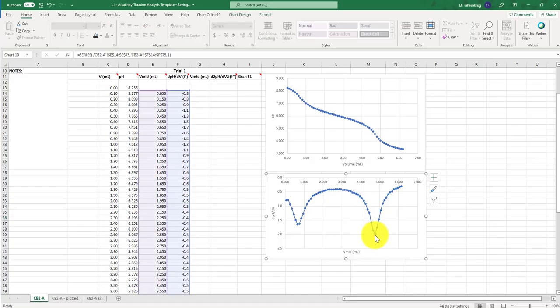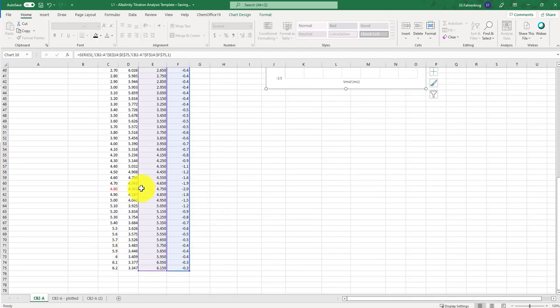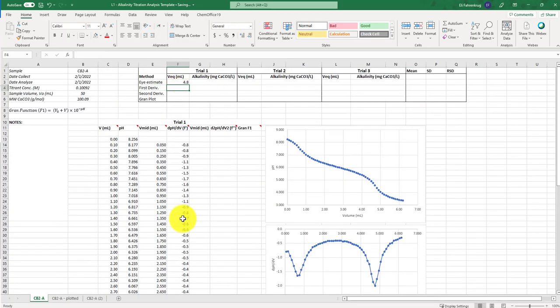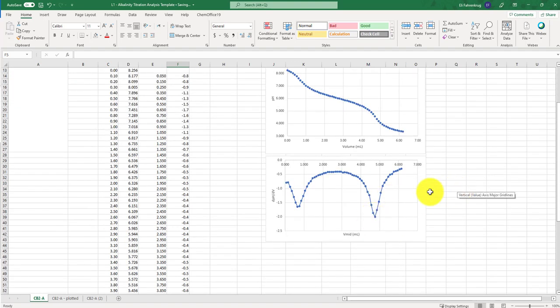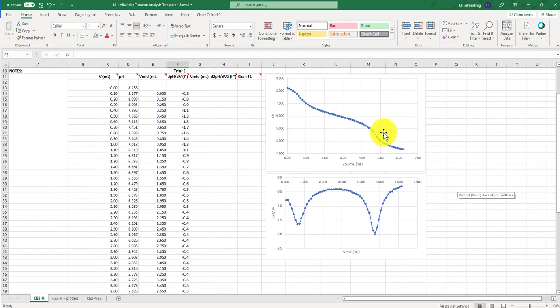So now this point, the point collected where we have the greatest change in slope, I can hover over that, and that gives me 4.750. So I can go down to 4.750 and we get a little bit of a different estimate here, so 4.75. And notice, it's really important here that for both of these, the eyeballing or the first derivative, it's really critical that you have maximum numbers of data points where the slope changes the most.